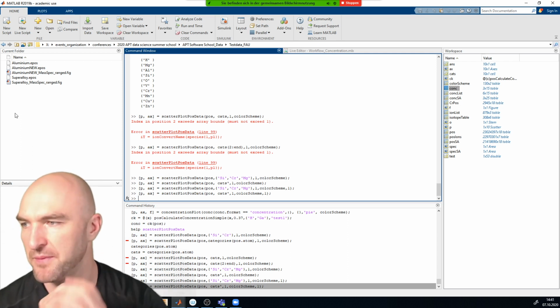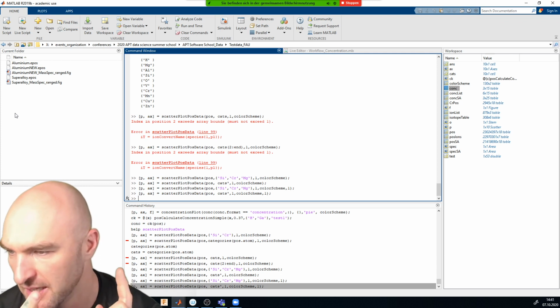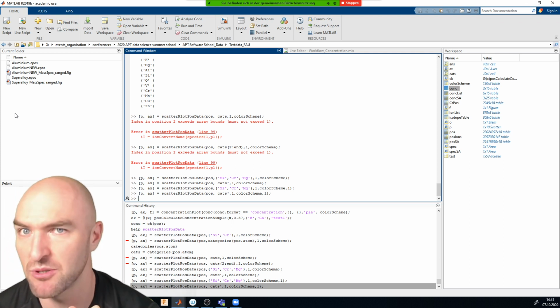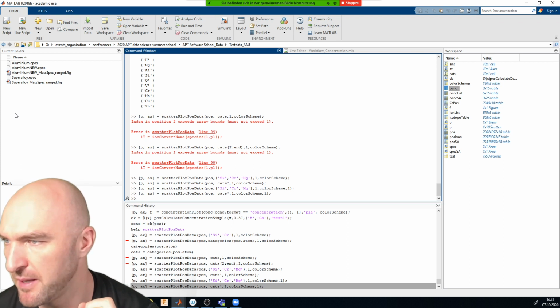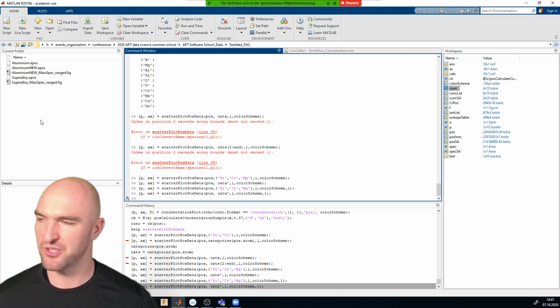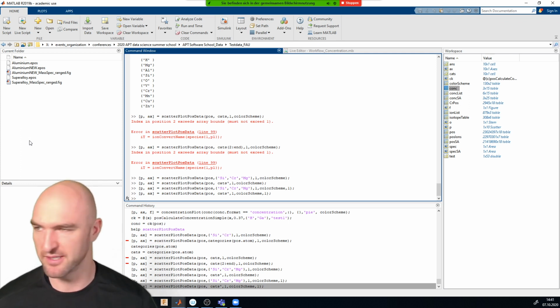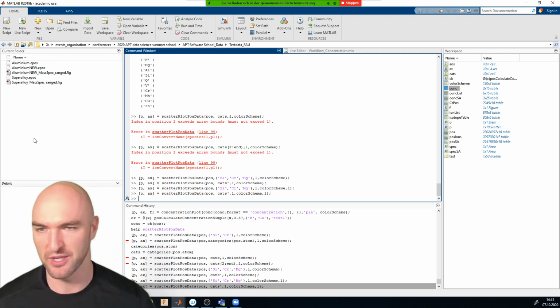So in the new updated version of the toolbox that Valentin has sent out, the problem with the pound sign has also already been resolved. And the problem with people not having access to the get rectangle command, which I find rather curious because this is an extremely simple command. Why would MathWorks restrict that? Anyway, I'll put it in the toolbox. But this is resolved now.